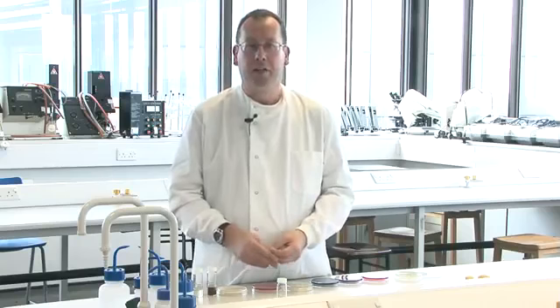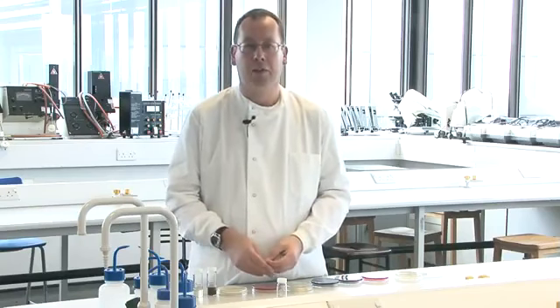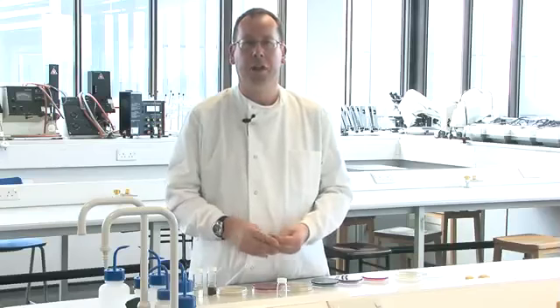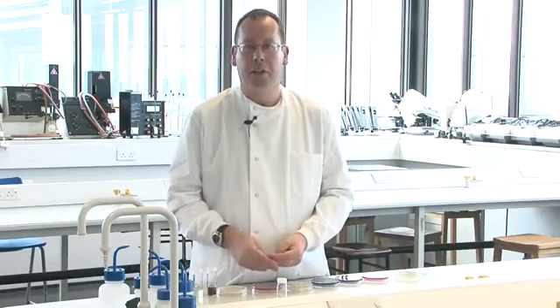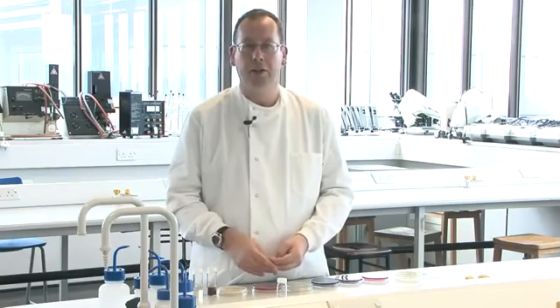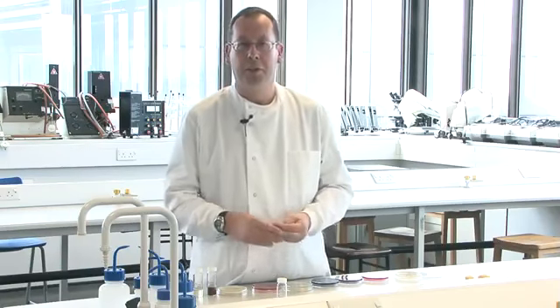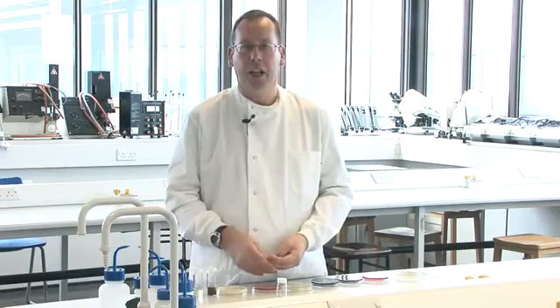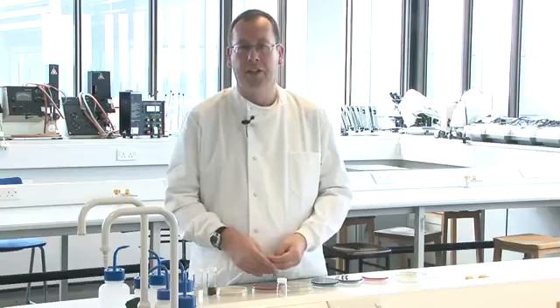So each substrate is matched up with a particular microorganism of interest. If that microorganism is present, it will utilise the modified substrate as it grows. Therefore, the modified substrate will be hydrolyzed, releasing the chromogen and producing a coloured colony. And so the specific colour of the colony is an indication as to the identity of the microorganism.